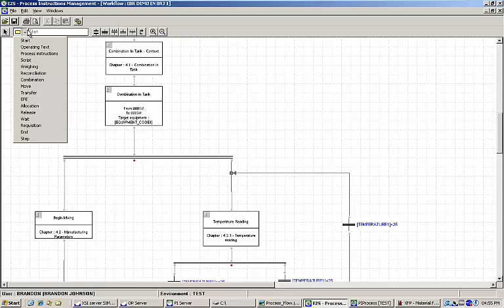Equipment can be allocated to and released from a specific work order to trigger genealogy links that can be tracked after batch execution.